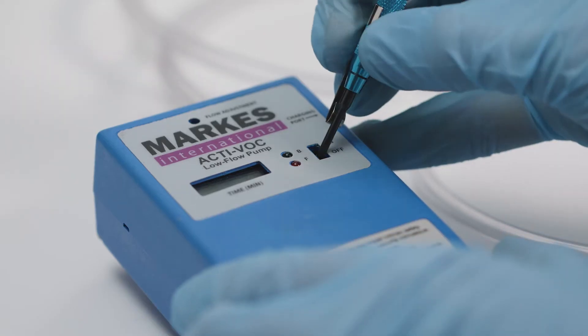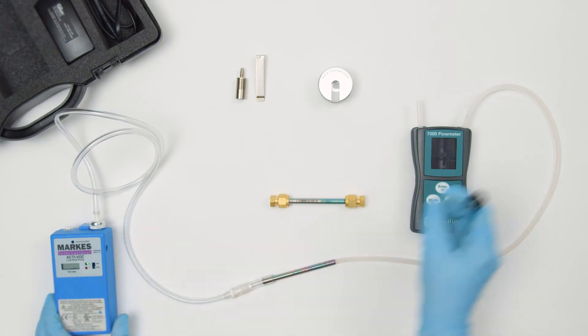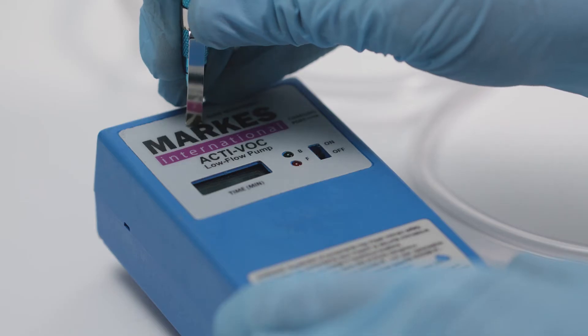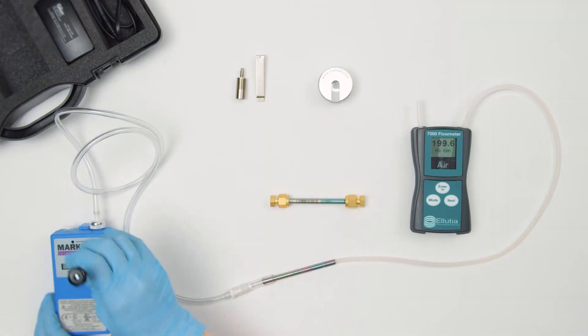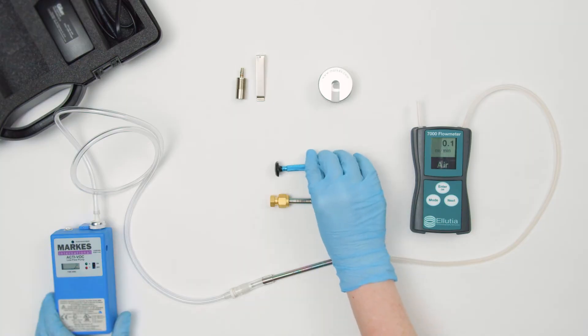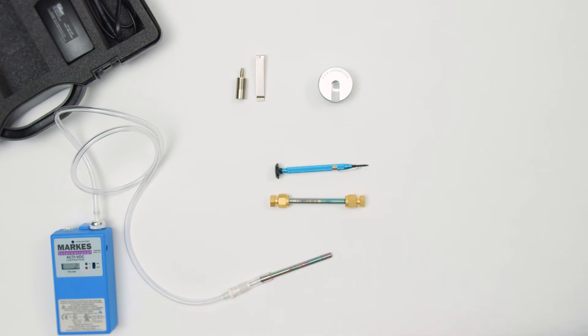Turn on the pump and the flow meter and adjust the flow on the ACTIVOC using the flat bladed screwdriver provided. When the desired flow rate has been reached, turn off the pump and remove the sorbent tube from the adapter. The pump is now ready for sampling.